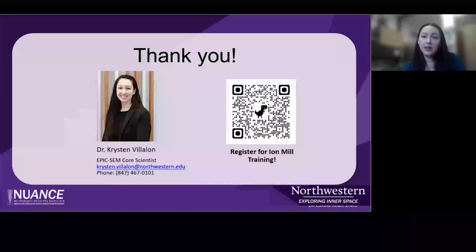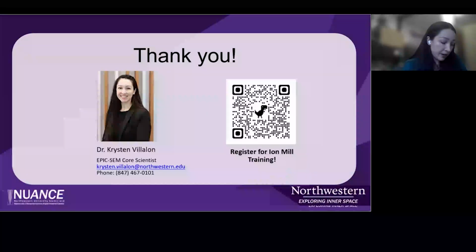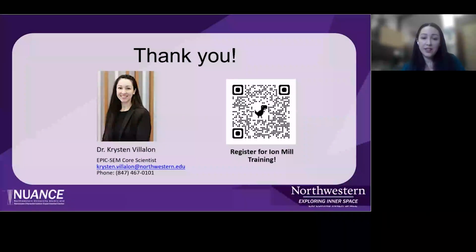So that's pretty much the end. Lastly, I want to mention to all of you Nuance users who are doing a lot of this analytical work with software like Aztec, we have access to a network license now. So if you want to be doing work in the comfort of your own home, also come by our office and talk to us to see how we can get you set up so that you can work remotely with Aztec.